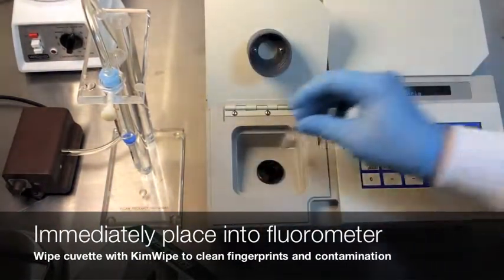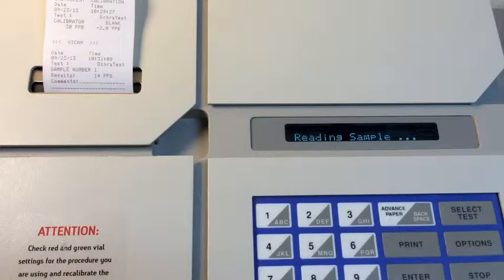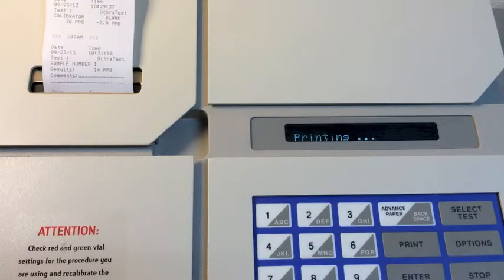Wipe the cuvette with a kim wipe and insert it into the Vicam fluorometer. Close the lid and you will receive results in 60 seconds. The fluorometer will print a time-date stamped record of your results.